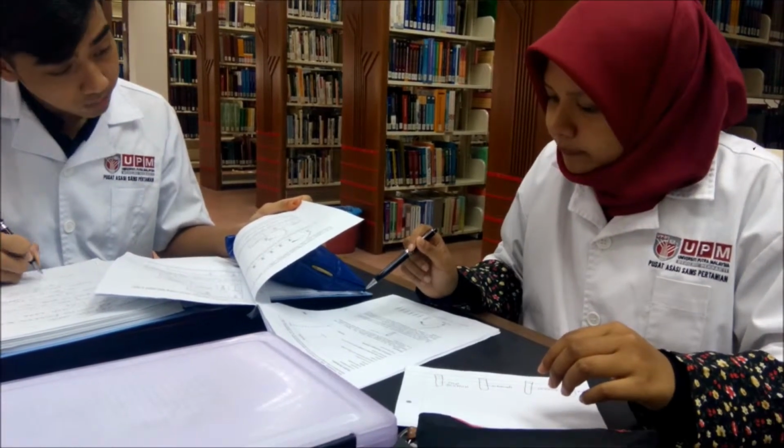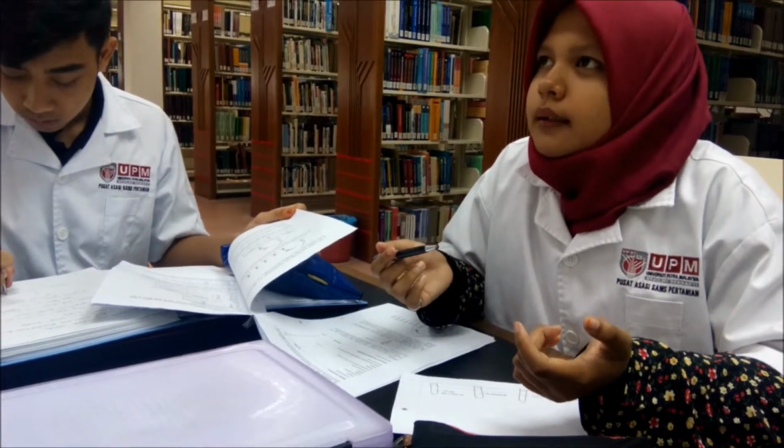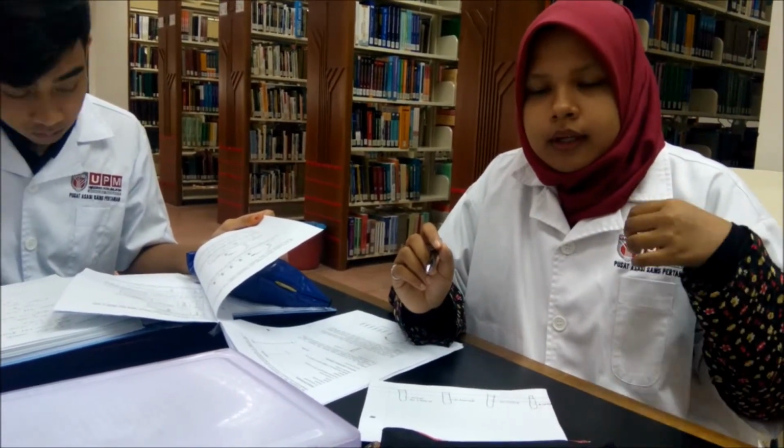And then remember to only label the upper part of the cuvettes. We cannot touch the lower part of the cuvette because it will disturb the reading of the absorbance when we use the spectrophotometer.